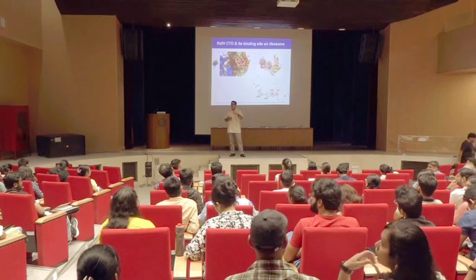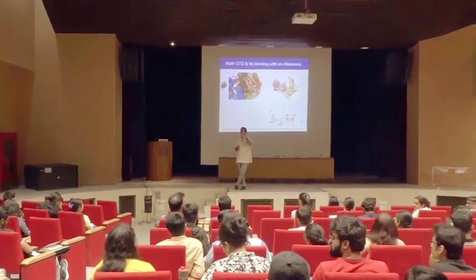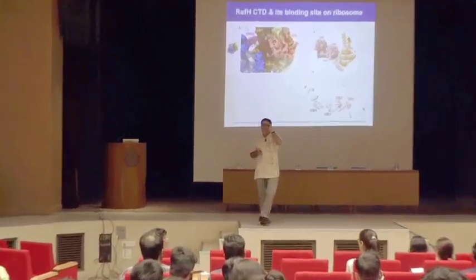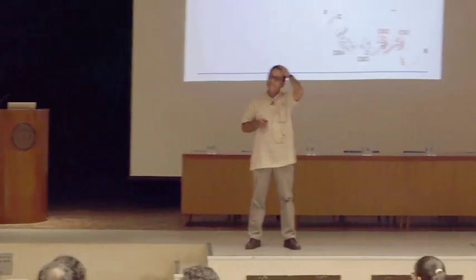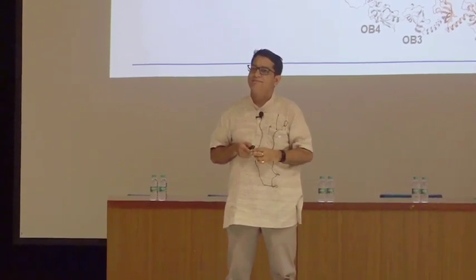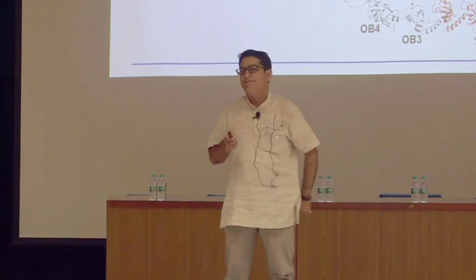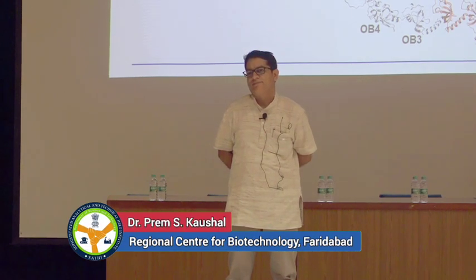I have referred to the literature, sir, but the problem is most of them have two motor domains of the myosin protein, so during particle analysis it will be really difficult to separate which isoform of myosin it is. During density gradient centrifugation, most of the myosin isoforms come along with the actin.